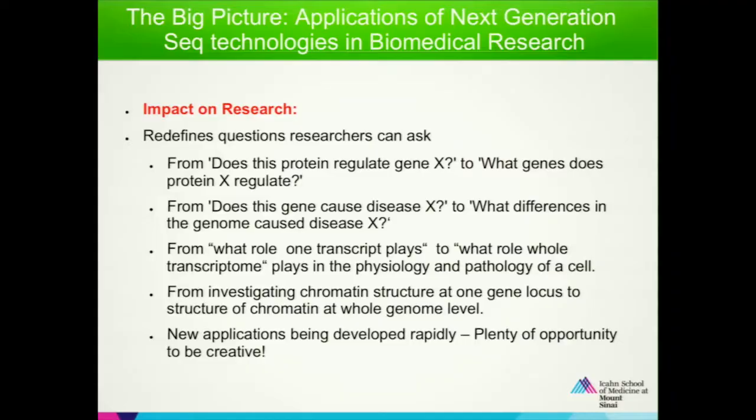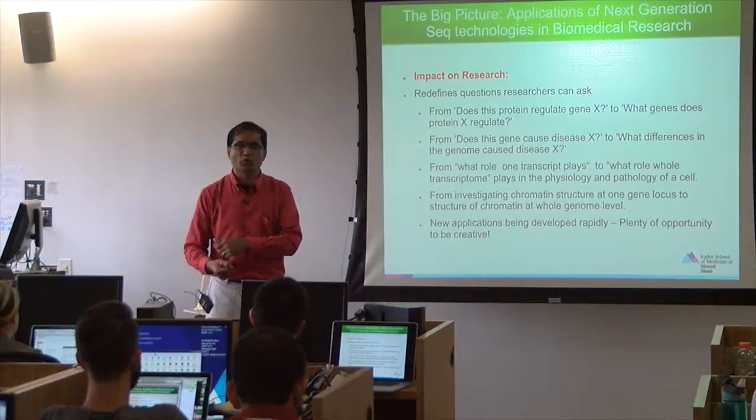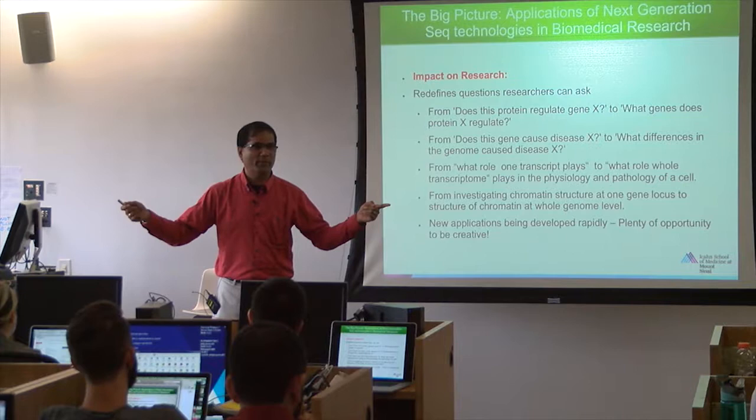Now, individually, do those cells express the same amount of RNA? Or is there any heterogeneity in that, and is that heterogeneity good or bad? Is it used to make one homogeneous function of the organ? So you can use that in different ways, and that knowledge can be used in pathology, to see how those different cells behave. That is what single cell sequencing can do, and you can also develop a different branch of medicine called genomic medicine. How we do that, we can briefly go over before we take a break.